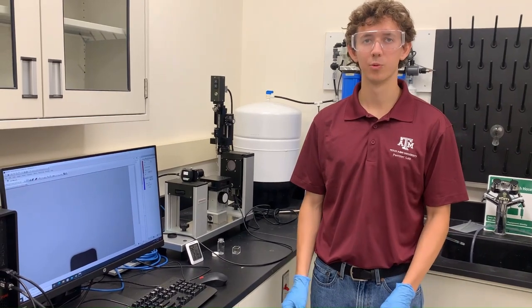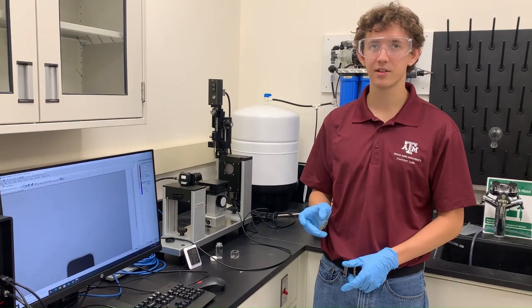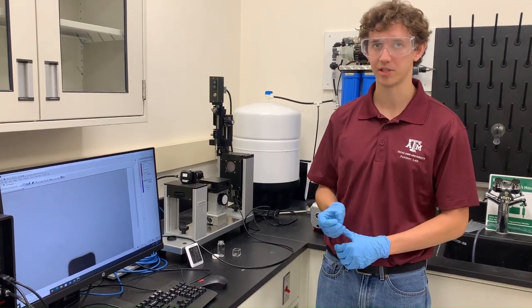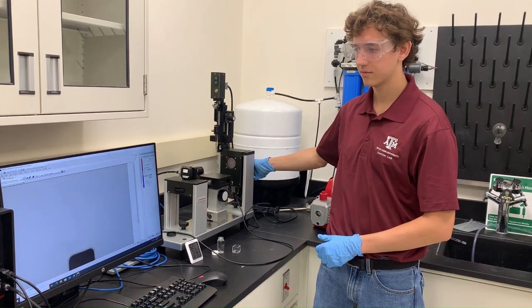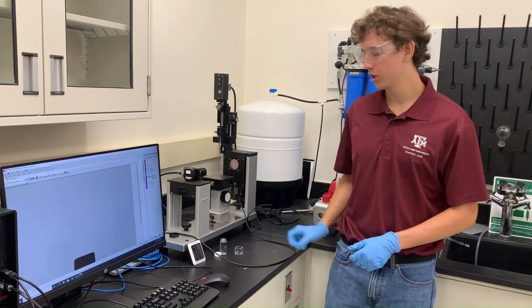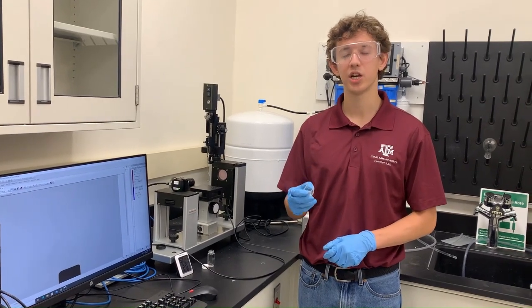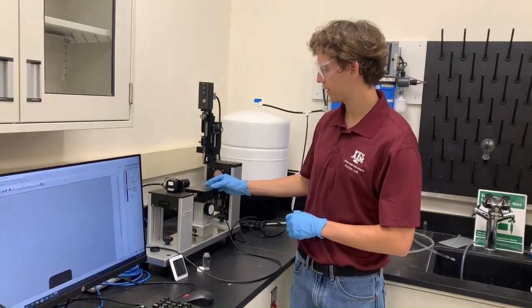After loading the syringe into the dispensing unit, bring your needle into the frame of the camera. Focus the needle using the lighting settings and camera settings. Great. Next, you want to place the glass cell, which will hold the continuous phase, onto the adjustable stage and raise it so that the needle is surrounded by the cell.